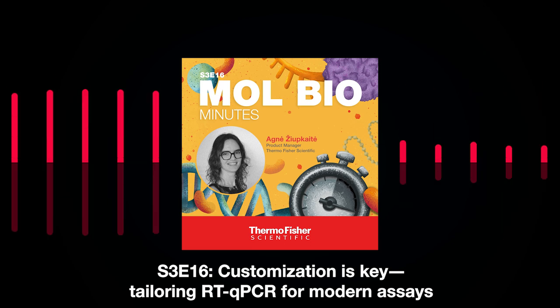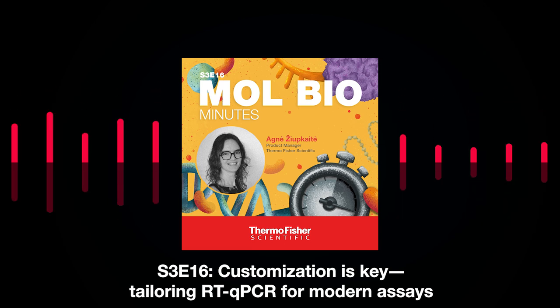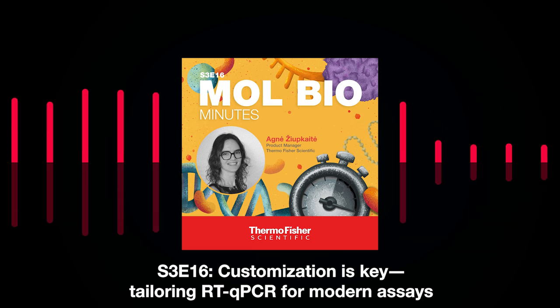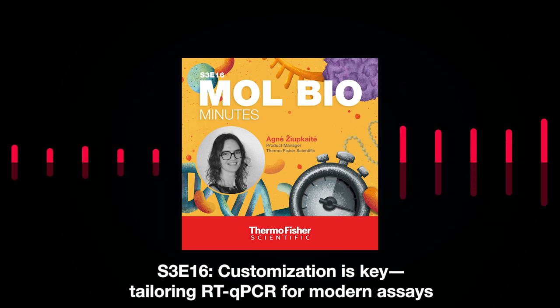Addressing these universal challenges is essential for developing a robust, reliable, and, as mentioned a couple of times, we can say together, efficient RT-qPCR assay. In summary, proper handling of RNA and cDNA synthesis is one of the most important steps to ensure that further molecular applications provide accurate results.